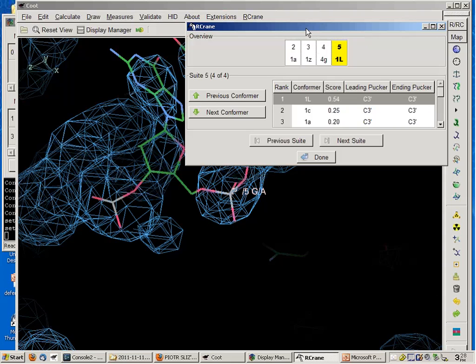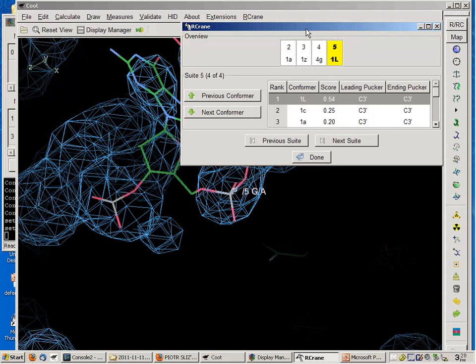And this score itself, is it calculated based on the geometry or the density fit, or both? Purely geometry. Yeah, so it's calculated based on a mapping between the pseudotorsions and the backbone conformers, and based on the p-perp distance for how well it matches the sugar pucker. And what's an acceptable score? Typically, the best scoring conformer is your best bet to go with.